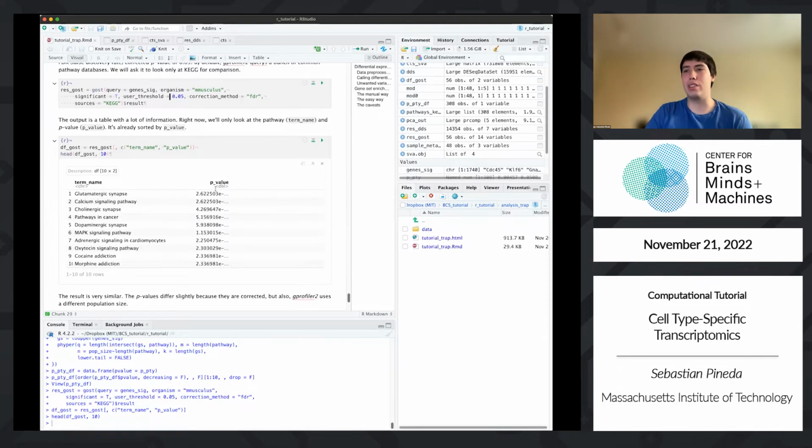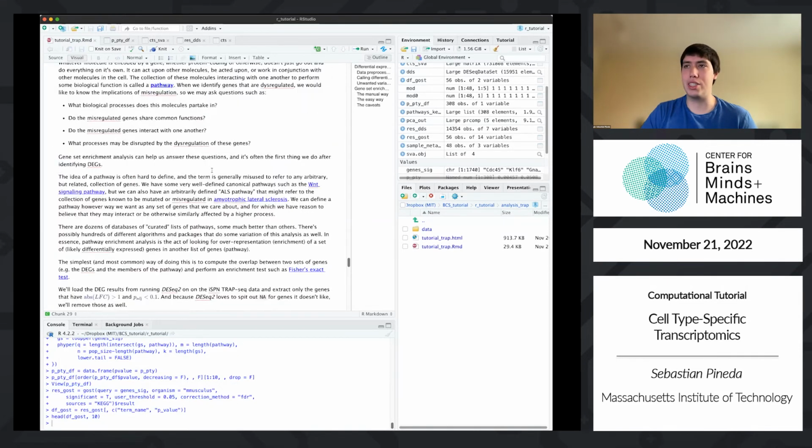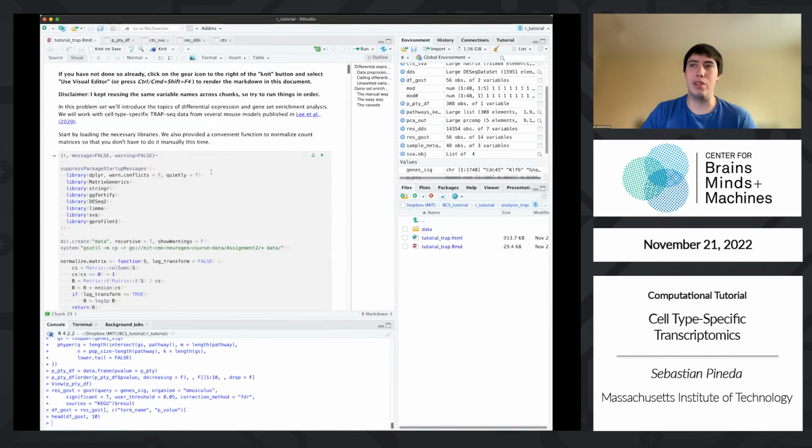So that's just a very basic sort of, not even necessarily TRAP oriented, but just RNA-seq workflow. And if you look at a paper that has done RNA-seq, these are at least the 2 things that everybody does. It's very straightforward, very easy. And when you do an experiment like this, that's really most of the time what you need to do. You get a list of genes, and those genes are your hits, and those are the genes you can go investigate. You can target them, knock them down, overexpress them.